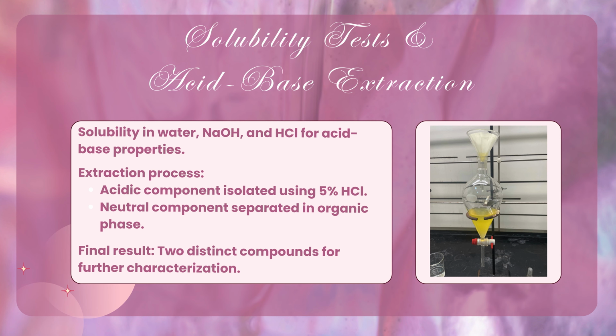So next, I moved on to the solubility test to differentiate between the acidic and neutral components. I began by dissolving the mixture in water and then I tested it with both sodium hydroxide and hydrochloric acid solution. The acidic component was soluble in sodium hydroxide, which suggested it had acidic functional groups, while the neutral component was not soluble in sodium hydroxide at all. This hinted that the neutral compound didn't contain any basic or acidic functional group but likely had a different polarity.